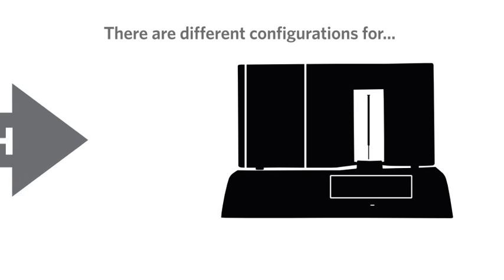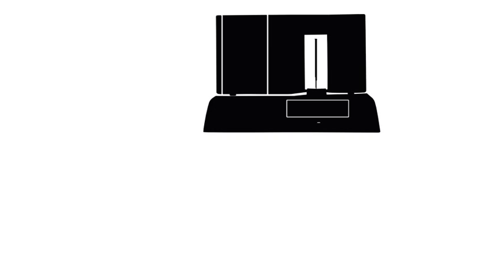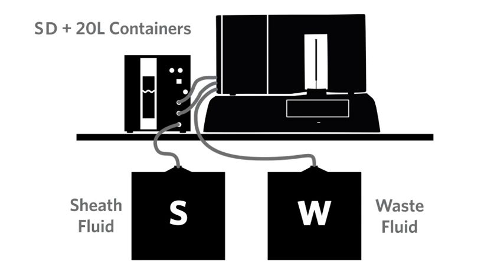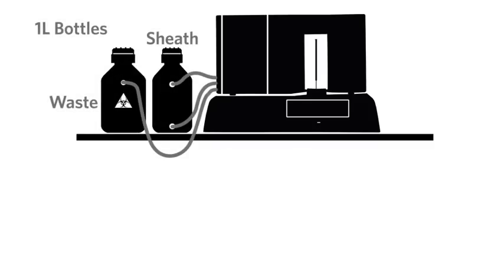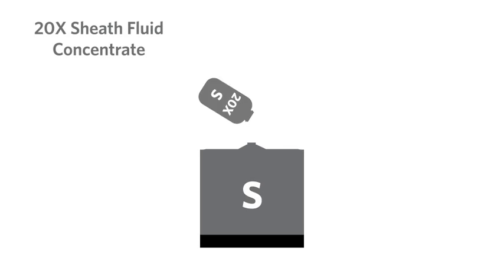There are different configurations for getting sheath fluid into the instrument and getting waste fluid out. One configuration uses the Luminex Sheath Delivery System, or SD, in conjunction with the disposable 20L sheath fluid containers. Another configuration replaces the Luminex SD with reusable 1L sheath and waste fluid bottles. In either configuration, 20X sheath fluid concentrate can be diluted to 20L and used instead.